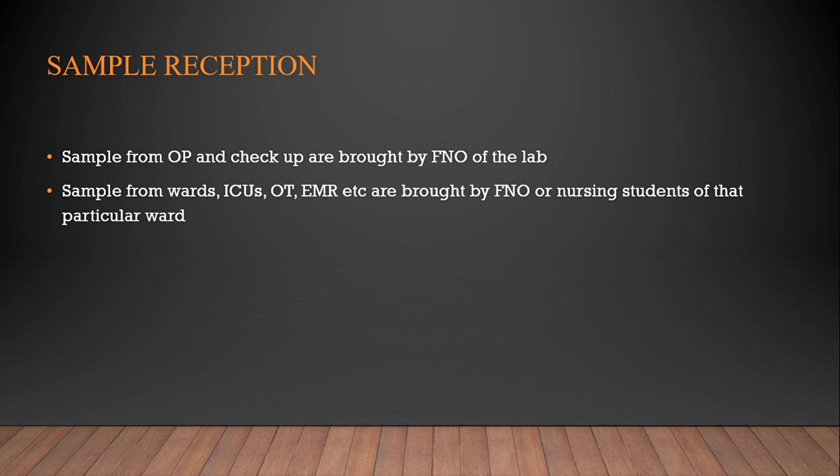Now the sample from our OP and checkup area is brought by our own FNO from the lab, whereas the sample from the wards, OT and all is brought by their own FNOs. Individual wards have individual FNOs, or sometimes even the nursing students will bring it to the lab.